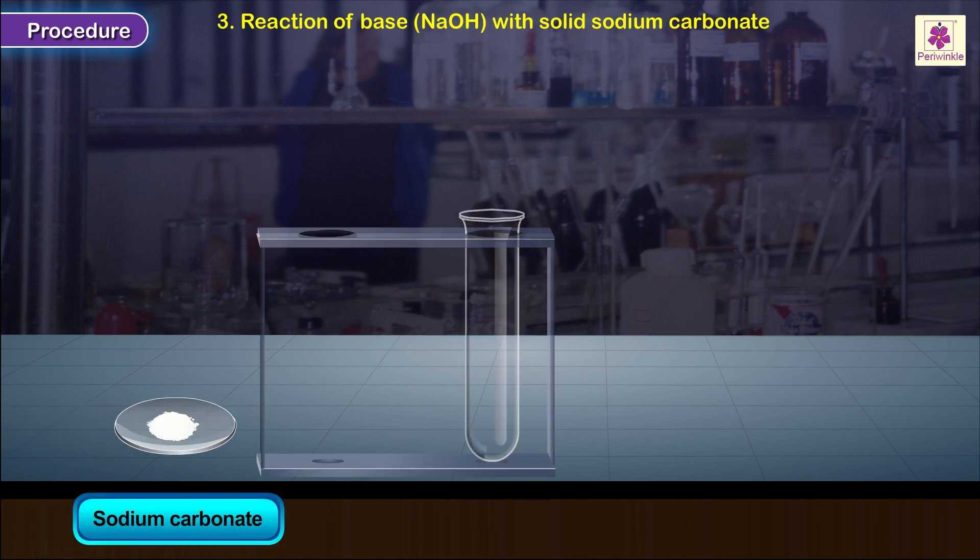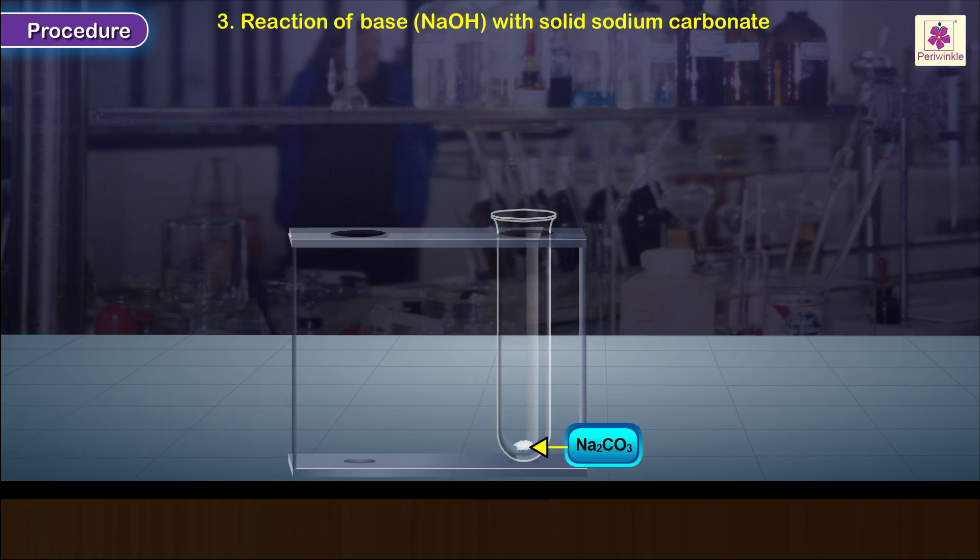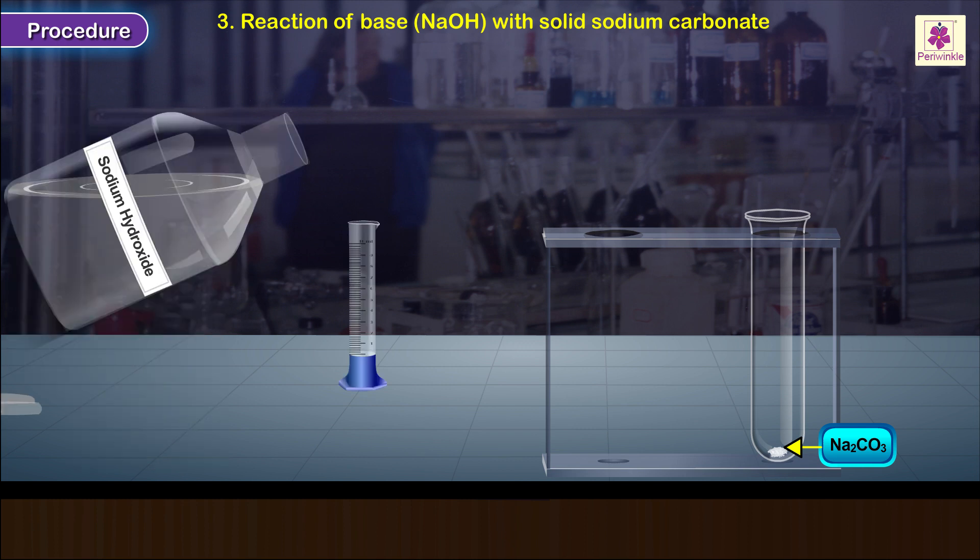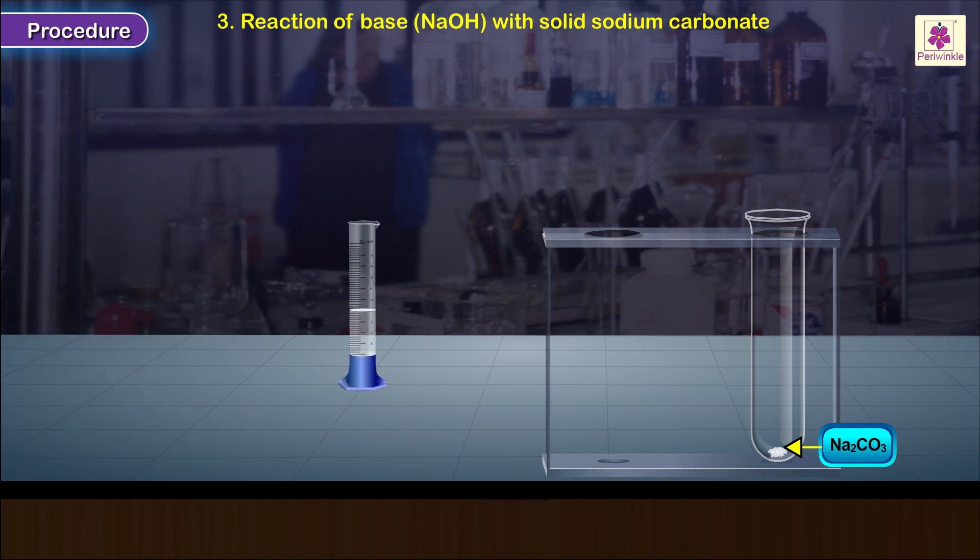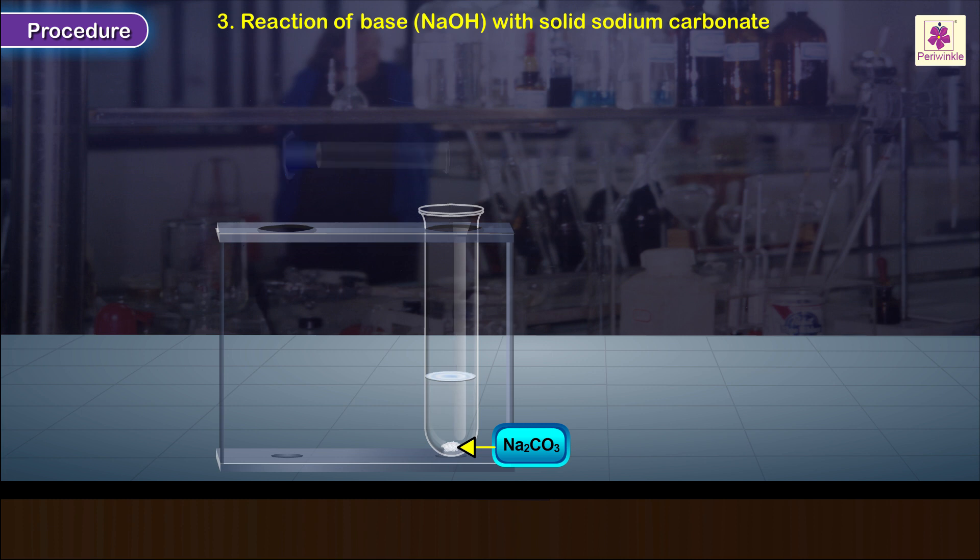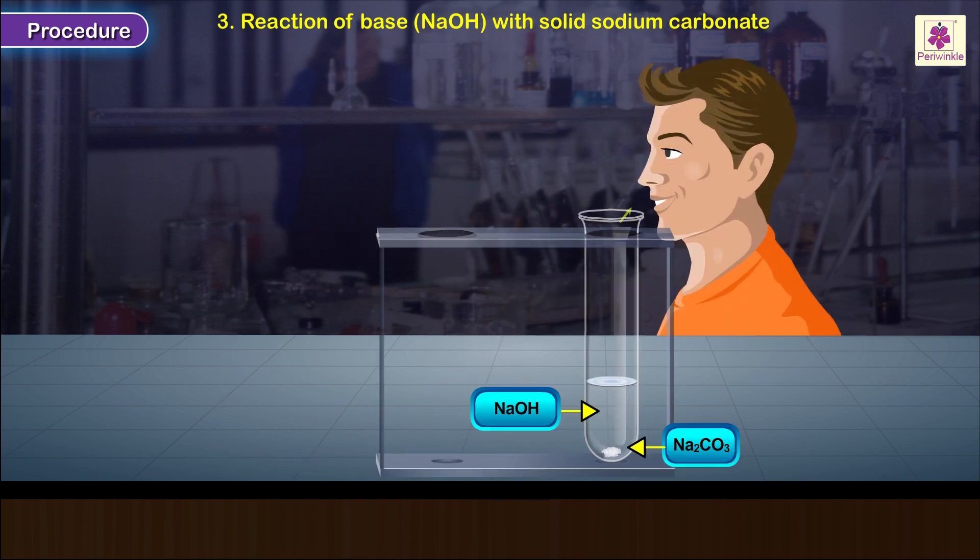Three: reaction with solid sodium carbonate. Take a pinch of sodium carbonate in a test tube. Add to it about 1 or 2 ml of sodium hydroxide solution. Cautiously smell the contents of the test tube and watch out for any signs of a chemical reaction in it.